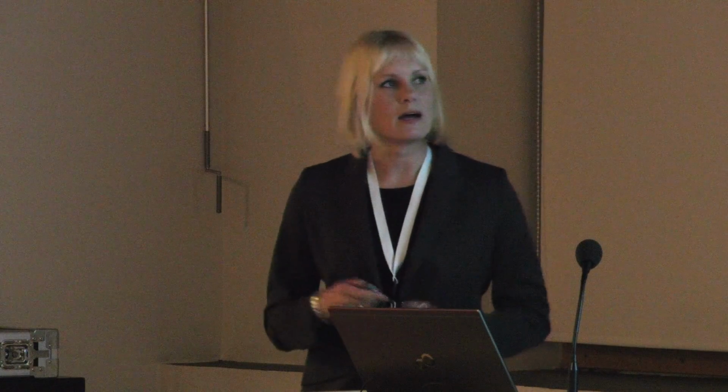However, it always requires handling. It's time consuming, it's not scalable. You just cannot handle too many flasks. With our traditional triple-layer flask, 72 flasks is what you can fit into one incubator. So that's our largest flask-type approach. You need to passage your cells. There's FBS typically present, but at some point you will face a problem, and it will be that you cannot scale. I cannot bring any more flasks to my process.